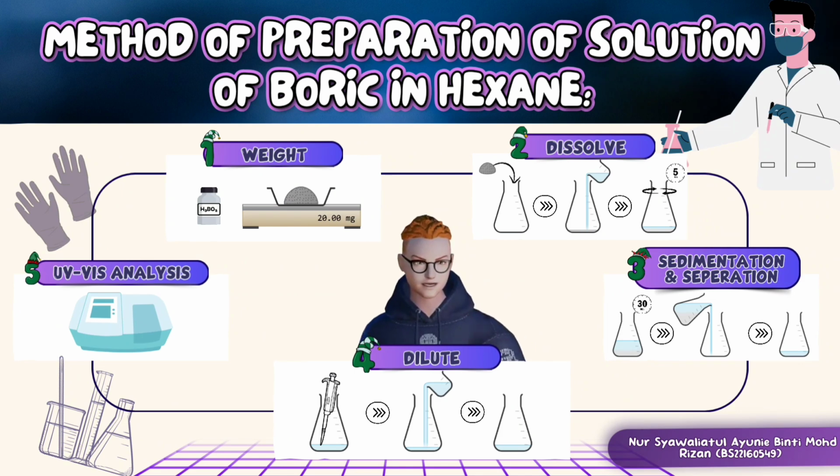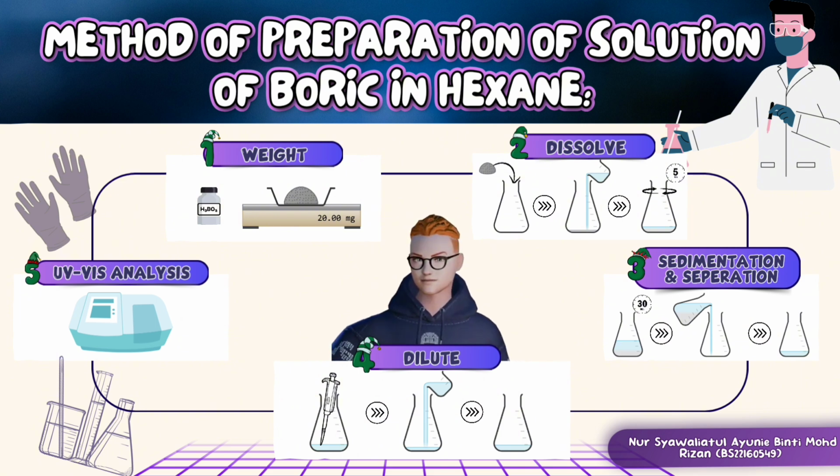20 mg of boric acid powder was measured, and then it will be dissolved in hexane to make a 1 ml solution. The solution was mixed by shaking it vigorously for 5 minutes to maximize solubility and will be left undisturbed for 30 minutes to allow sedimentation to happen.